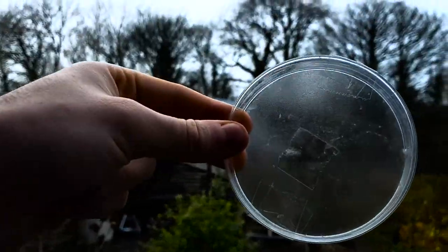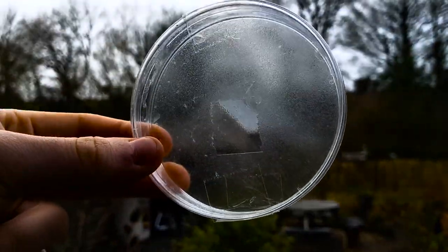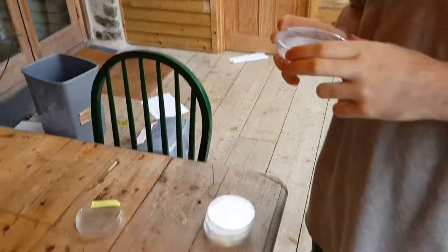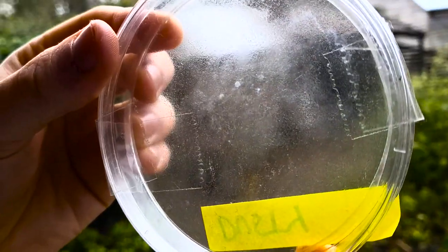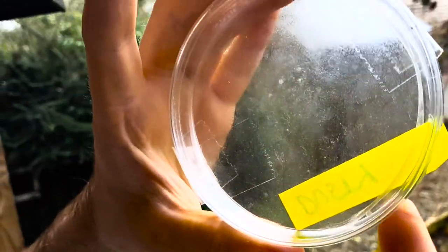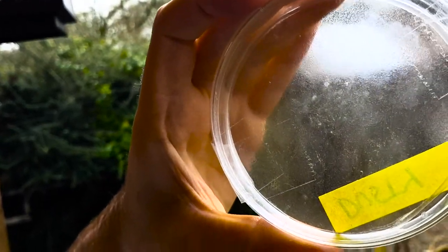This was the soap on the piece of tape. It's pretty much just a window. If you look at the side, there's some fluff and fluffy bacteria. If it's got fluff, probably not clean. I don't remember what part of Dusty that was. Was that his mouth? It is, yeah. It's his beard. I think this as well has started to peel, so it's probably dying. Yeah. This is not the peak.